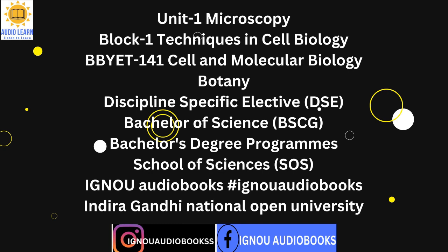1.2.2 Light microscopy. You might have used microscopes in the laboratories. These are called light microscopes or optical microscopes. In this type of microscope, visible light passes through the specimen, the biological sample, and is bent to form a magnified image. Lenses focus light on the specimen, magnifying it, thus producing an image. The magnification varies depending on the types and number of lenses used in the microscope. Optical microscopes are of two types: simple or compound.